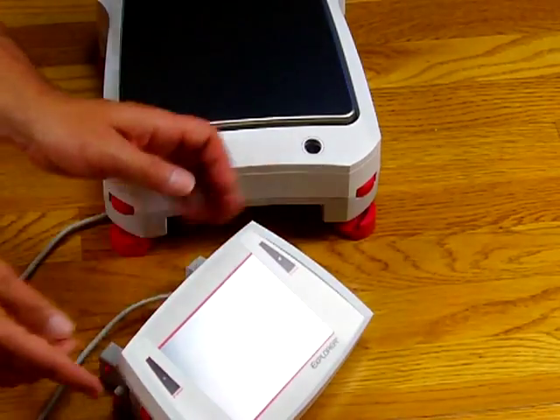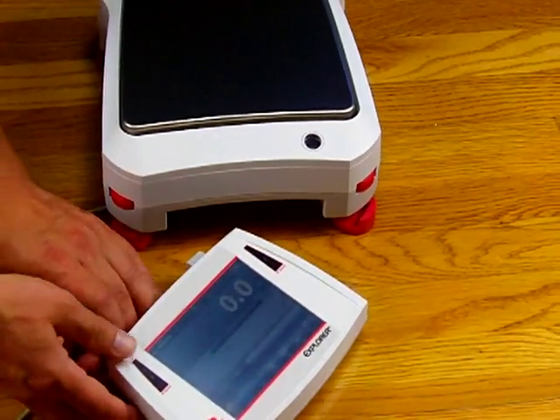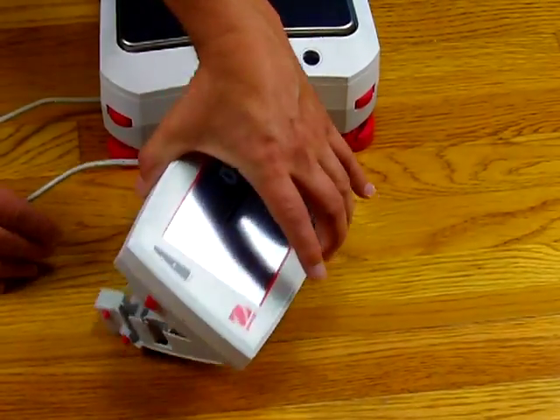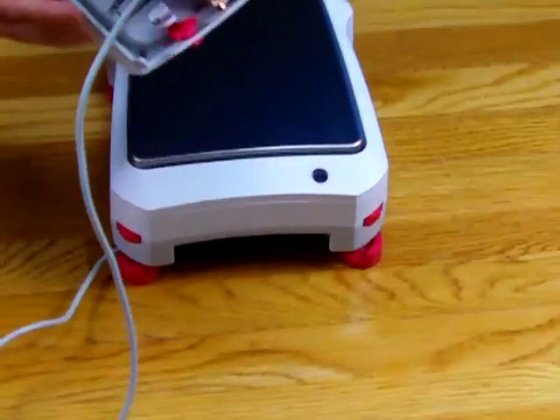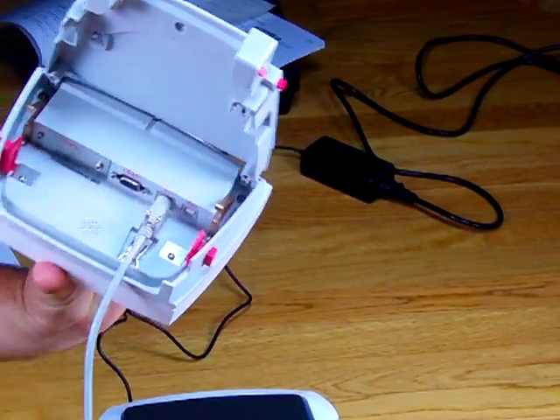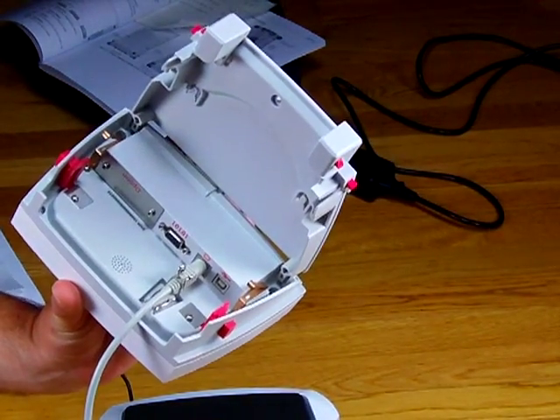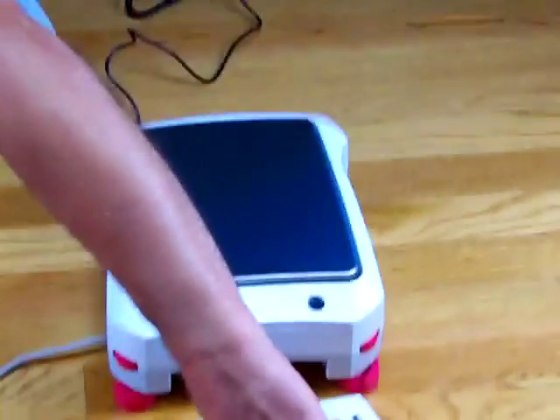There's a little plastic button on the side so the indicator height is adjustable — it can go down, or you can press the button and raise it up. On the rear of the indicator we have an RS-232 interface, also a USB port, and this port here is for optional communications you can select, including another RS-232 and other features. Let's discuss some more features of this balance.